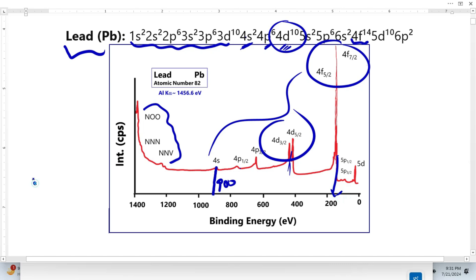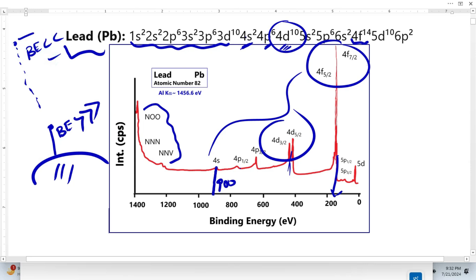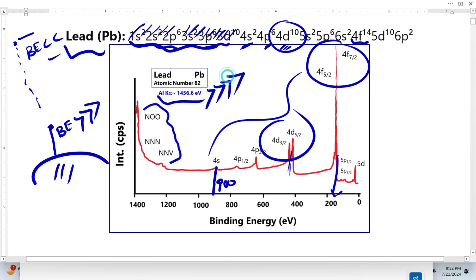This confirms the principle: electrons closer to the nucleus have greater binding energy, while electrons farther away have less binding energy. The reason the innermost core electrons do not appear in the lead survey spectrum is that they have very high binding energy, and the available X-ray source energy range is not sufficient to generate photoelectrons from those core levels.